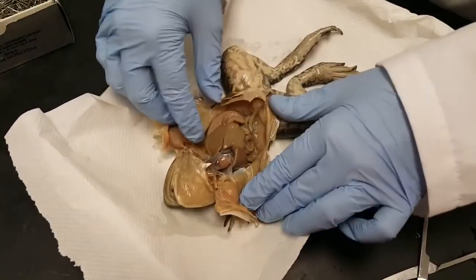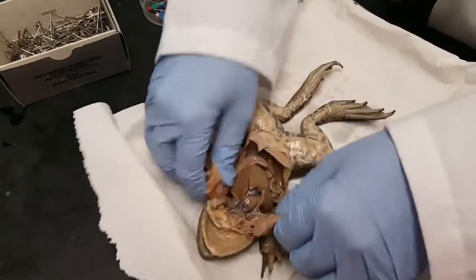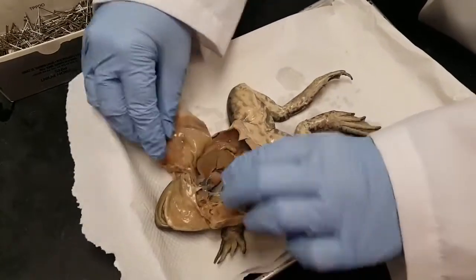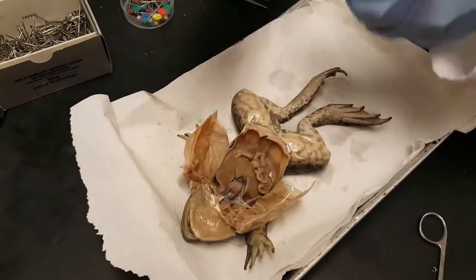Now sometimes there's a lot of fluid in there — I like to drain it a little bit. And then you can pin back the skin so that you can have easier access to your organs. I'm going to use these pins to pin them back.